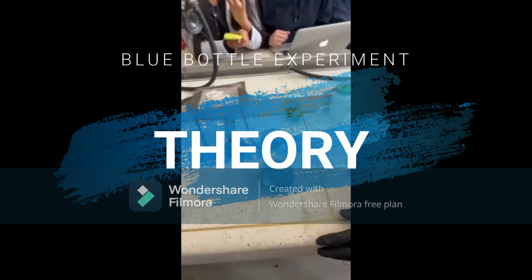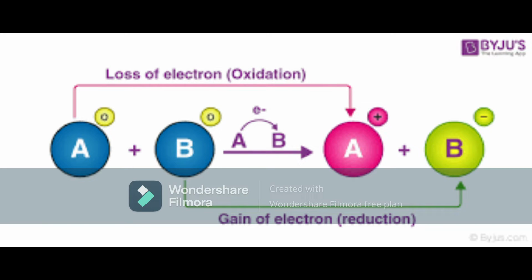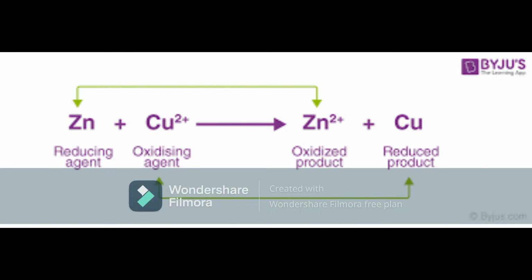Oxidation reduction, or redox, reaction is any chemical reaction in which electrons are transferred between two participating reactants. The transfer is identified by noticing the change of the oxidation number of an ion, atom, or molecule, and seeing if it is losing or gaining an electron.